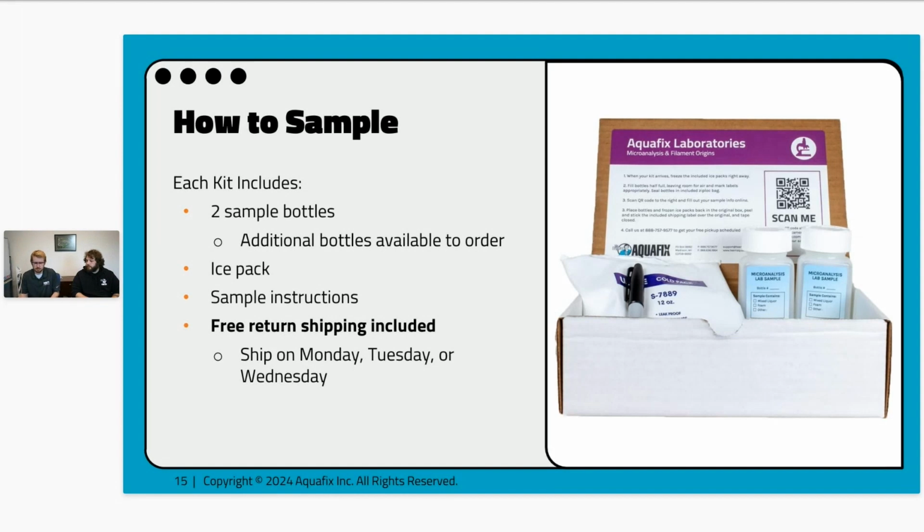So in that kit, it's really important to have the form submitted with it, because as Sarah was talking about, microscopy is an overarching look at how the system's doing. So knowing how your BOD, ammonia removal, and any other indications and information you can get to the lab is going to be really helpful as we're looking at your system.